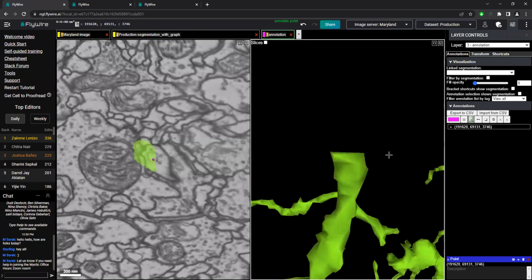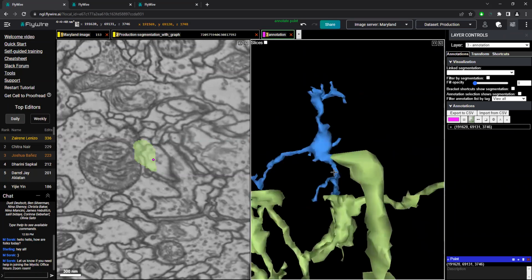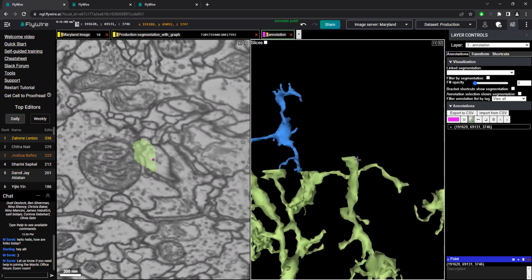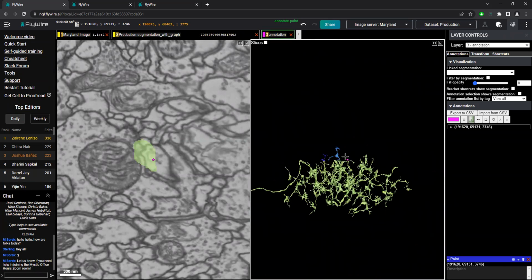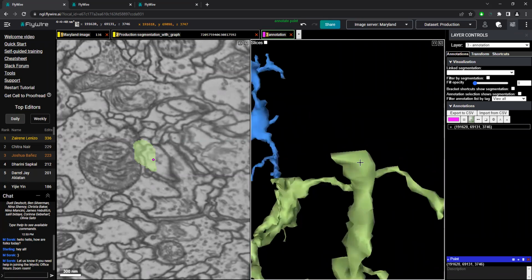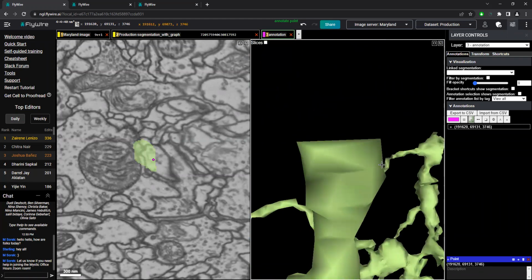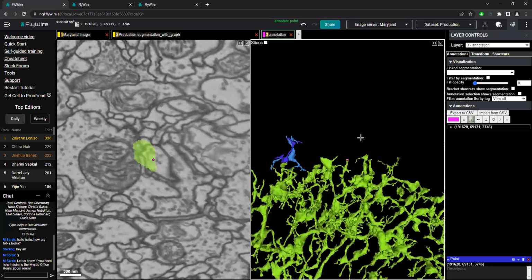And sometimes if you zoom in real close, the annotation scales with your zoom, so that's why it shows more when you're zoomed out, when we have the big pink dot, but then when we go in, it gets really tiny and we can't see it within the 3D like this. Unfortunately, there's not much we can do about that problem in terms of how that works. Do you have any other questions?